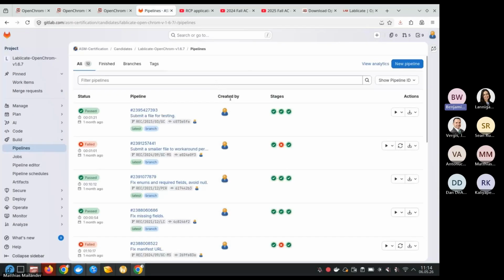Yeah, I didn't. Of course, it's really easy to make mistakes when creating ASM. Maybe it's a missing field, maybe it's an instrument serial number that somebody said is mandatory in this format. Then you have to add this field to comply with the standard. So that's something easy to forget. It's also easy to get something subtly wrong.